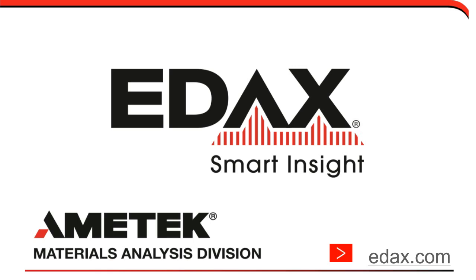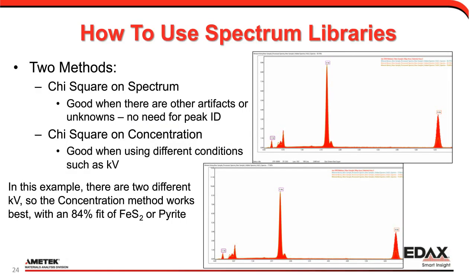Good question. When using the search filter, does it matter what elements you identified in your original matching spectrum? If you fit carbon in the matching spectrum and don't in the unknown, does it matter? Great question. We've got two different methods for spectrum matching, and that is chi-square based on spectrum and chi-square based on concentration. And I think I've pulled up this slide.